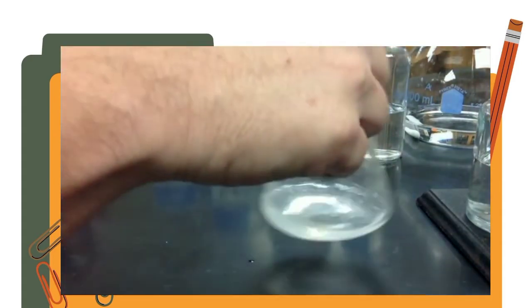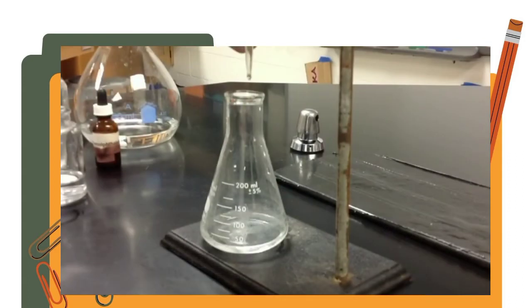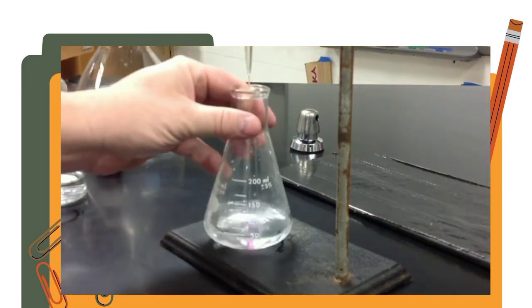It will clear because phenolphthalein is clear in acid solution. And now we will begin the titration process by adding some sodium hydroxide to our acid solution. You will notice that we are going to start seeing pink, and as we swirl it, the pink will disappear. So we will add it at a little faster rate. See the pink forming, and we'll swirl it and notice the pink goes away. And our job as we titrate is to bring it to a point where the pink color holds, even though you may swirl it. That is the endpoint of our titration.